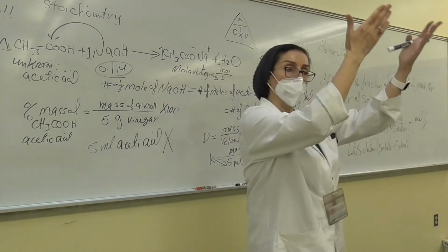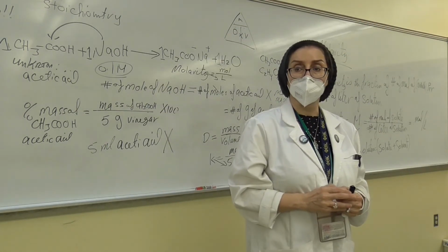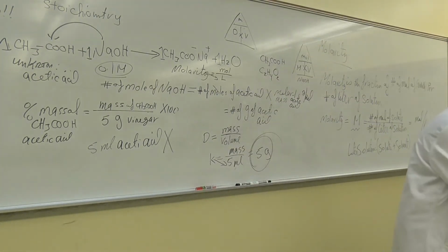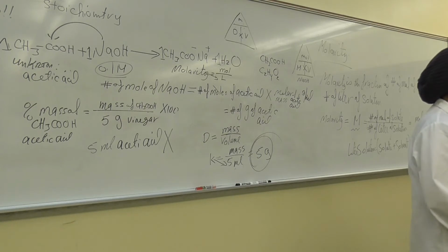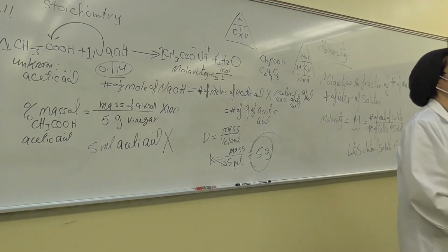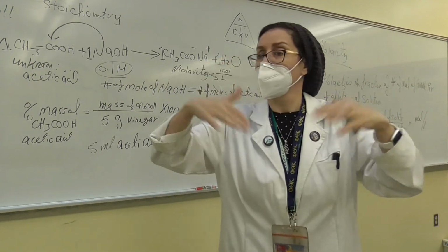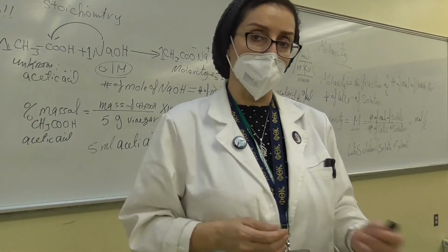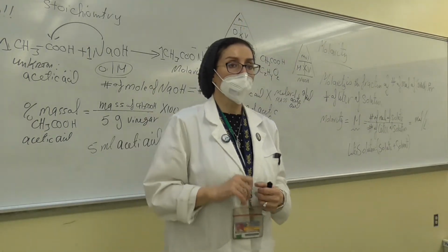And then you're going to start the titration, all right? Follow the procedure, there is a very clear description. Let me see the page number. I just want to direct you to the right page number. So the page number that is telling you about the procedure of this experiment, where is it? What is the page number? 28. It's only a very small paragraph. It explains how to put 5, then you add 50 ml, and then you start the titration, okay?